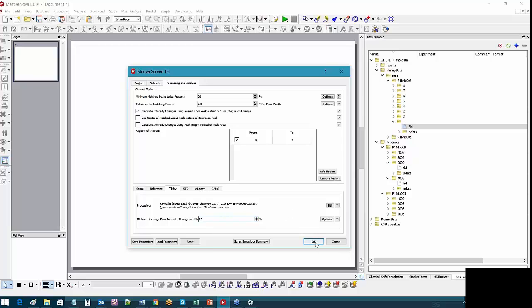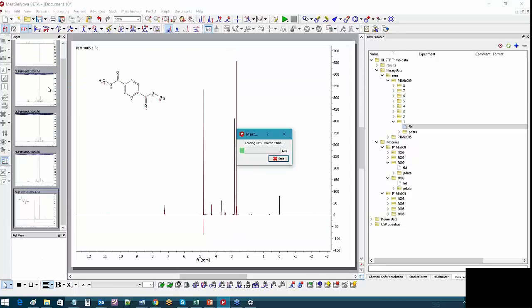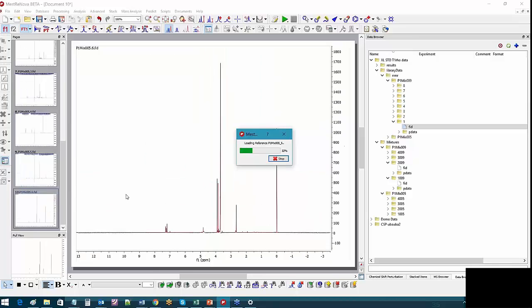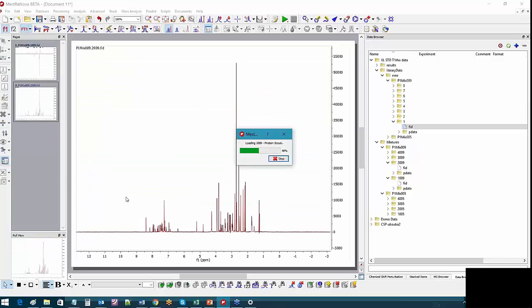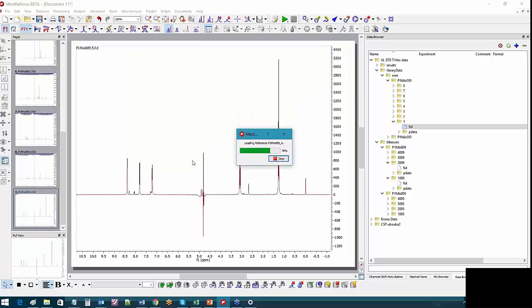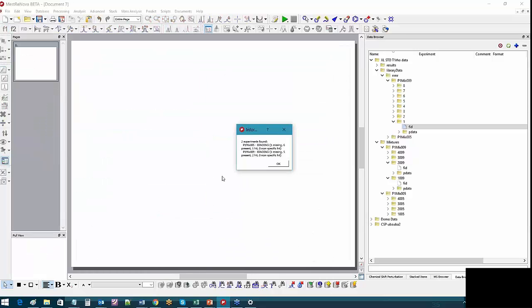We click OK, and then it goes through the first sample to process the mixture spectra and also the 8 reference spectra. It stacks them and measures the peak intensity changes, and also matches the STD difference peaks, etc. Then you proceed to the next one, the second mixture. Due to time, I cannot do too many of them, so I'm doing only 2 experiments here.